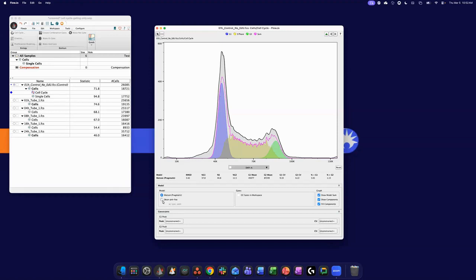Now with the Dean Jett Fox, you can also remember there's the assumption that all of my cells have entered the S phase in unison. So if I hit that, it really didn't give me much improvement. So I can see, at least in my case, I'm probably going to want to just go back to the first one.